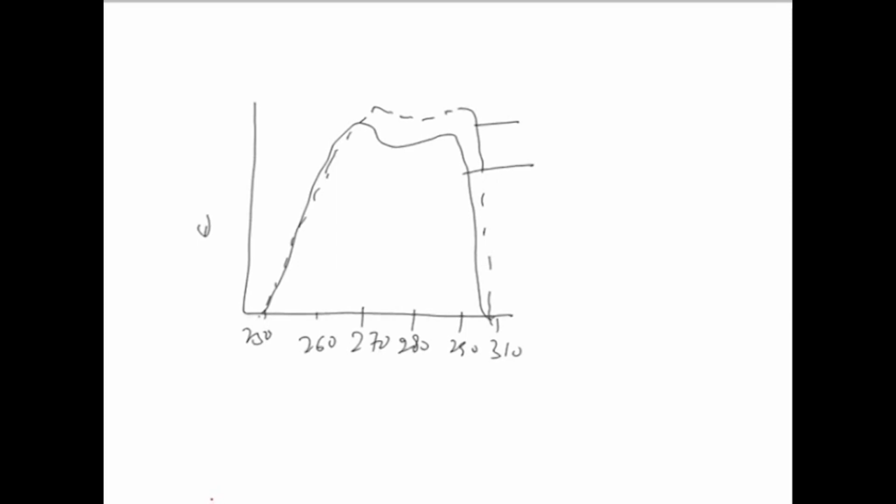One is in ethylene glycol, which is less polar, and another is in water. One spectrum is in a polar and another in a less polar solvent. You can see there is a lambda max increase here. The lambda max is increased in the case of the less polar solvent. So, polarity will certainly affect the lambda max and also the molar absorption coefficient.